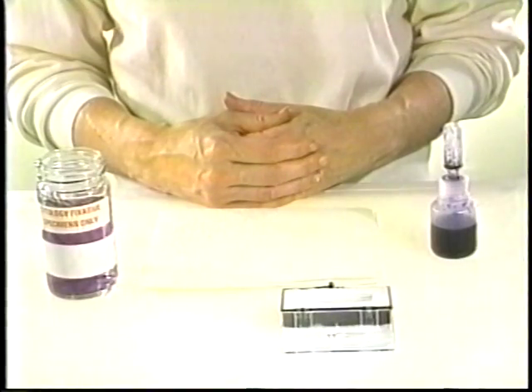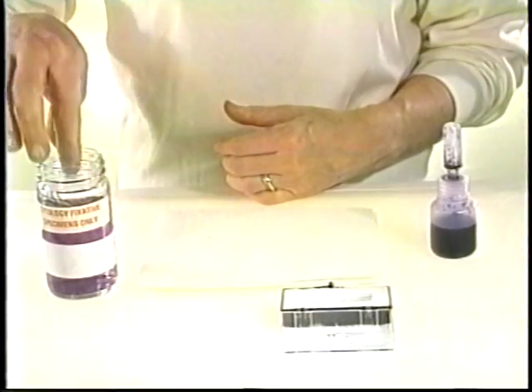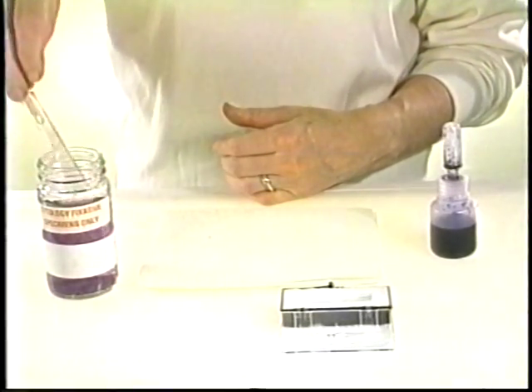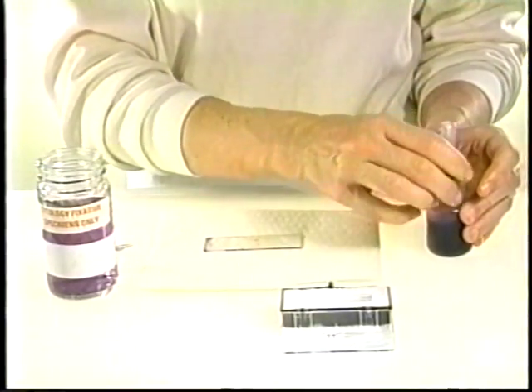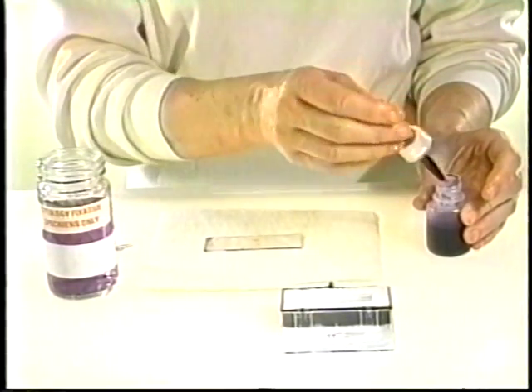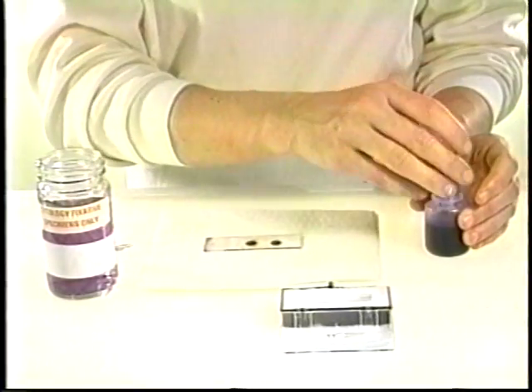Diff-Quik can also be used. Toluidine blue is very easy to use. After fixing the slide in 95% ethanol for about 1 minute, the slide is retrieved and placed on absorbent paper. One or 2 drops of the stain is placed on the smear and a cover slip is placed on top.